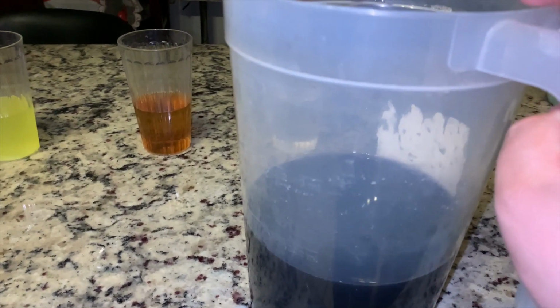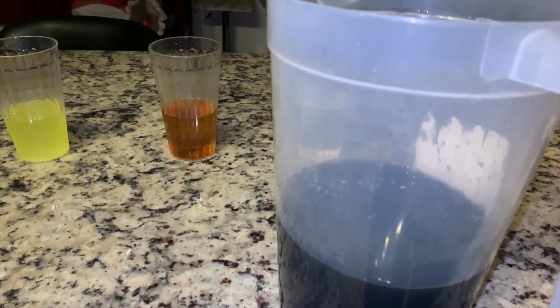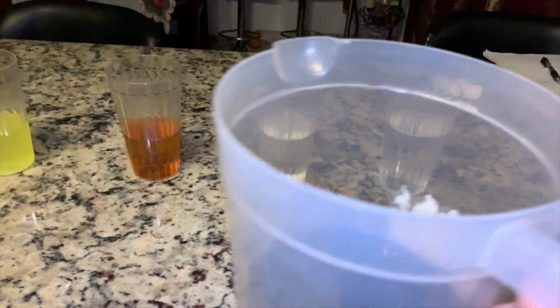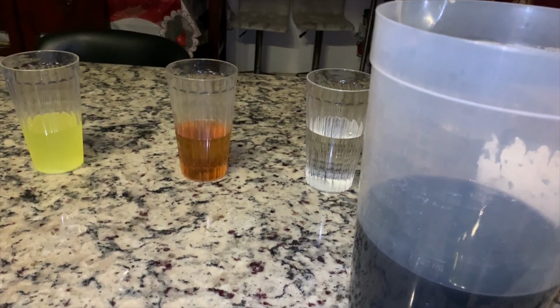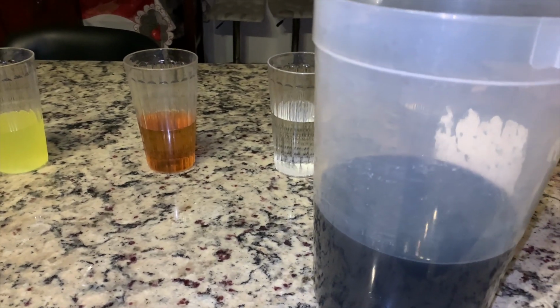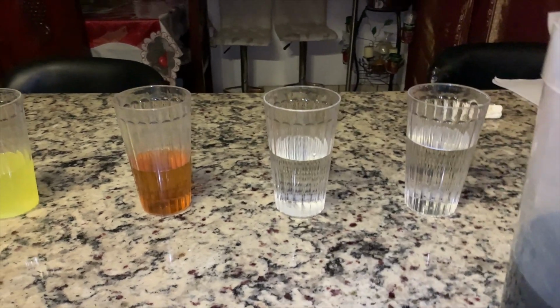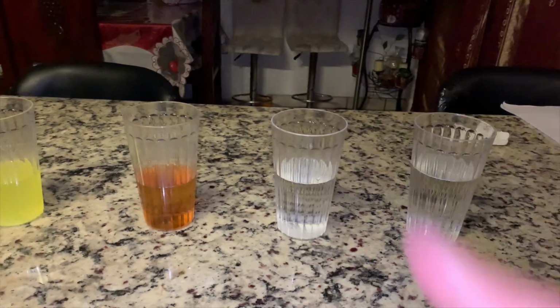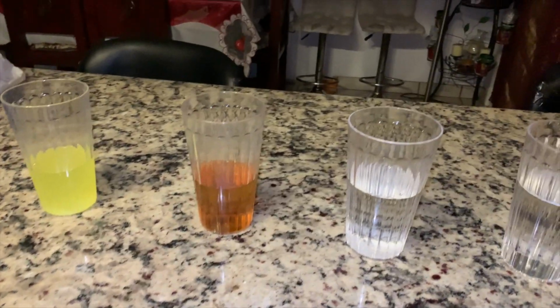The purpose of this lab is just to test the level of pH in different liquids. Like for example, right here I am using water, tap water, acetic acid or vinegar. I have apple cider vinegar, and then on the far left I have Gatorade. So as I said, the main purpose of this is to test the level of pH each liquid has.